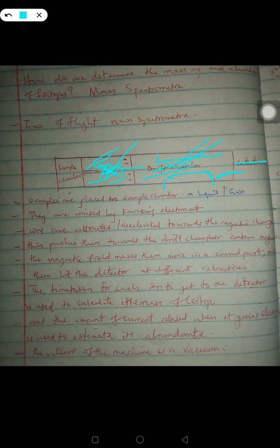But the movement is not a straight movement, it's a curved movement controlled by the magnetic field in the drift chamber. So immediately they bend across that, they go straight to hit the detector. Now this is where it's very important to understand.